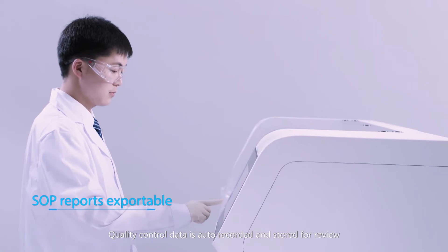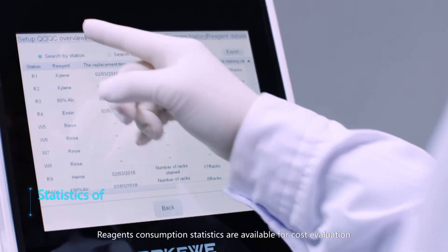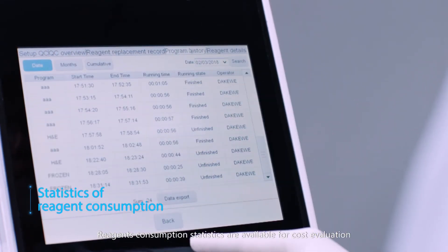Quality control data is auto-recorded and stored for review. Reagent consumption statistics are available for cost evaluation.